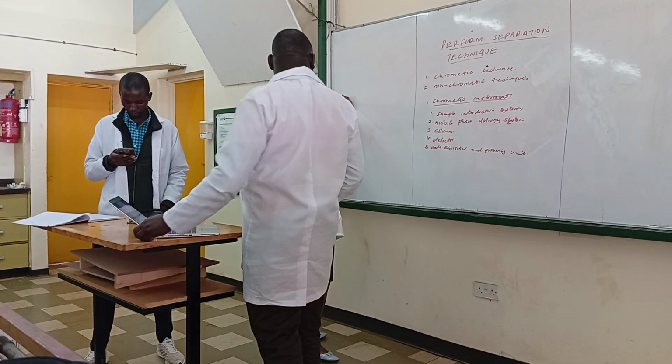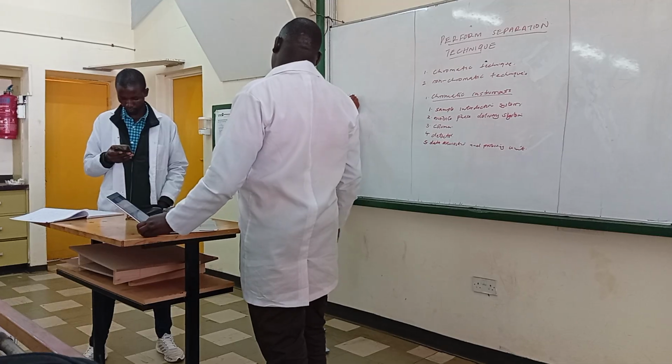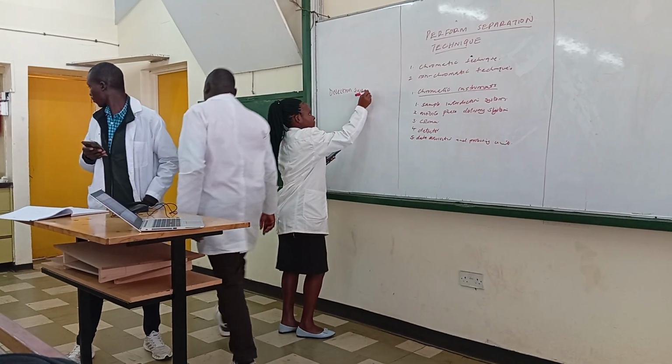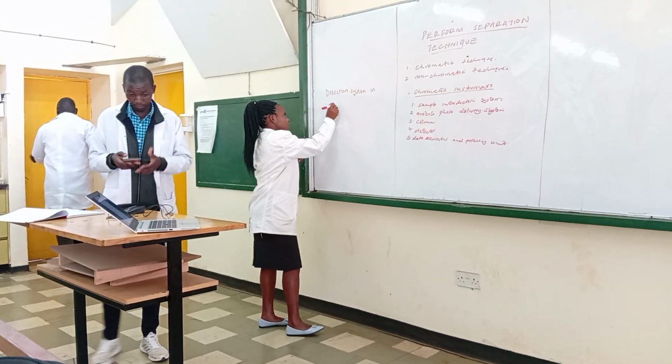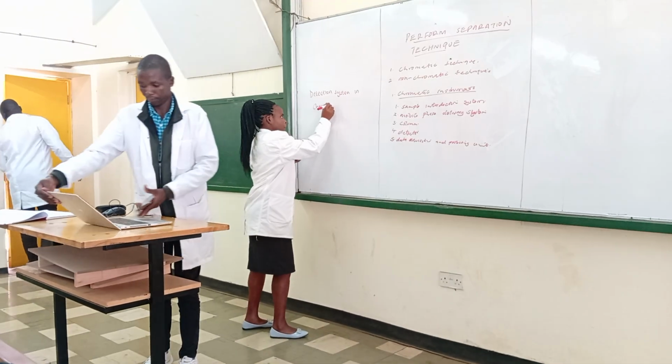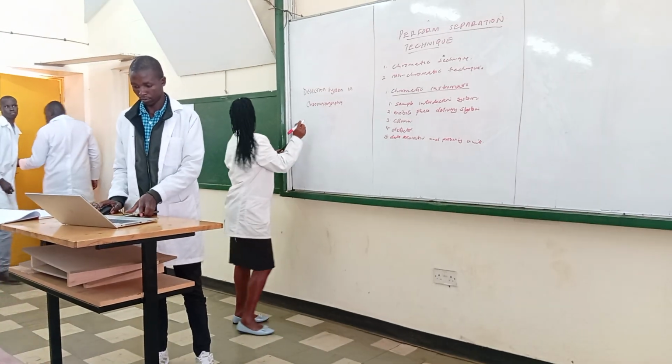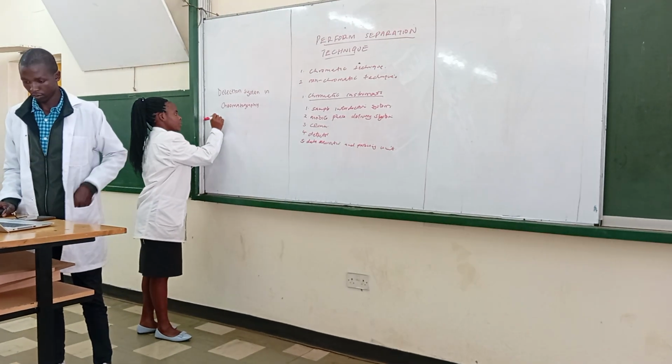I present to you the detection system in chromatography. We are going to discuss the types of detectors.